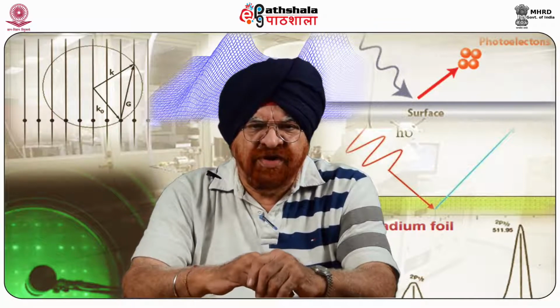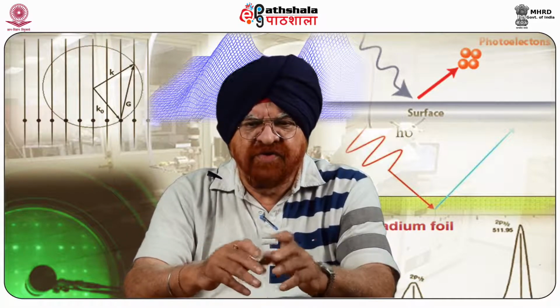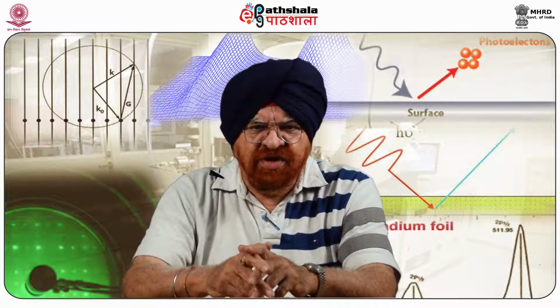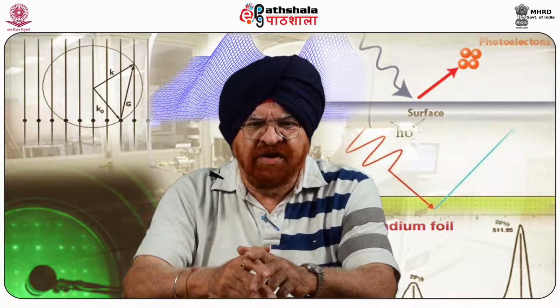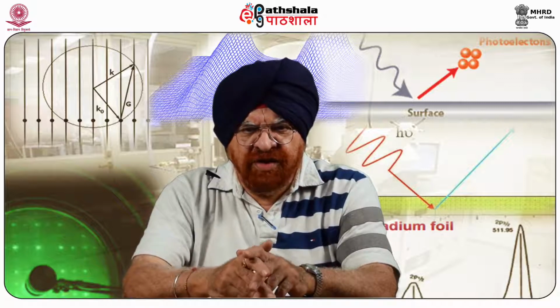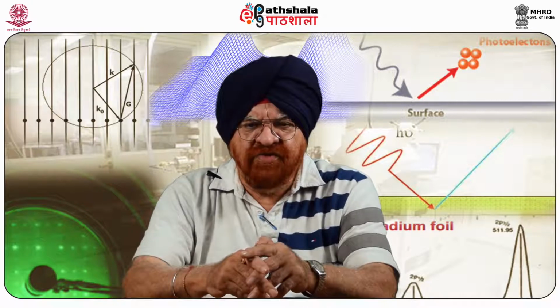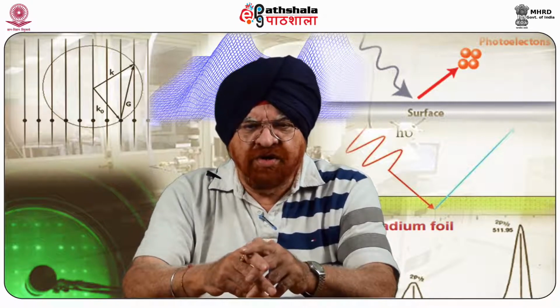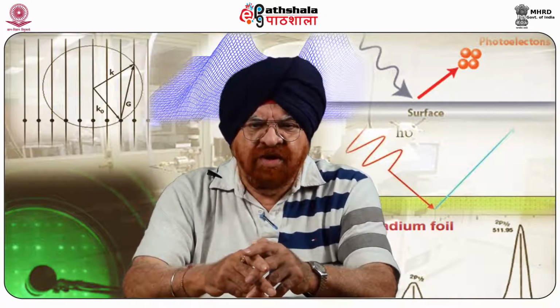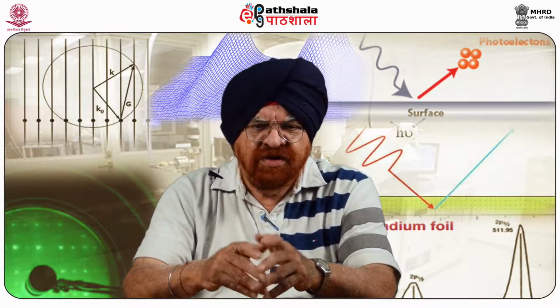In 1887, Heinrich Rudolf Hertz discovered but could not explain the photoelectric effect, which was later explained in 1905 by Albert Einstein. In 1907, P.D. Innes experimented with the Roentgen tube, Helmholtz coils, and a magnetic field hemisphere.